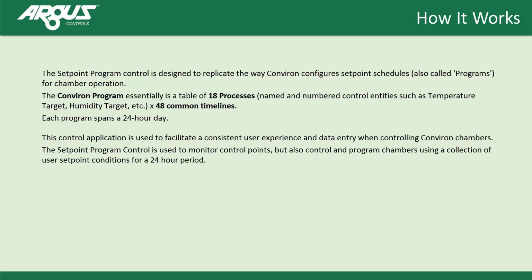This control application is used to facilitate a consistent user experience and data entry when controlling Conviron chambers. The Setpoint program control is used to monitor control points, but also control and program chambers using a collection of user setpoint conditions for a 24-hour period.